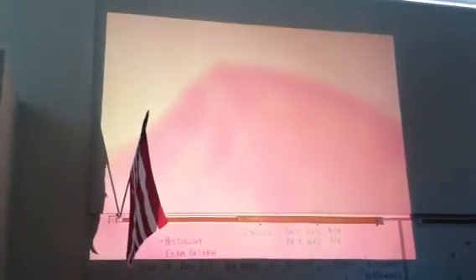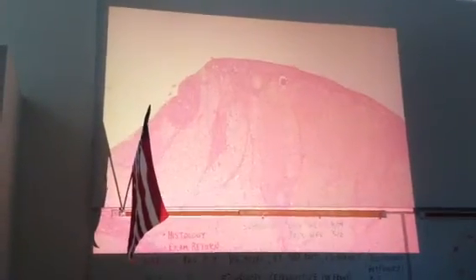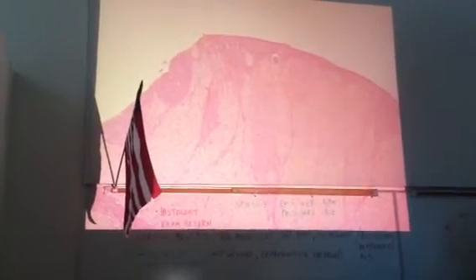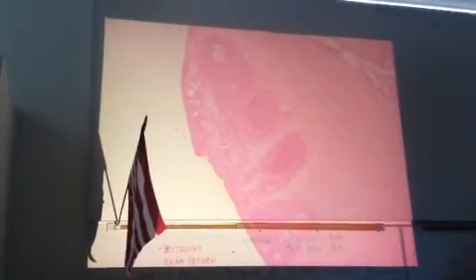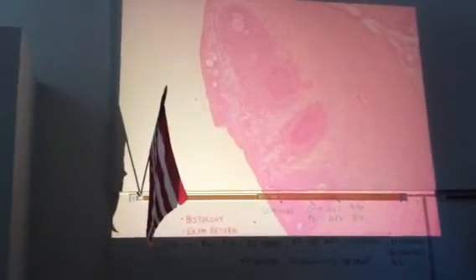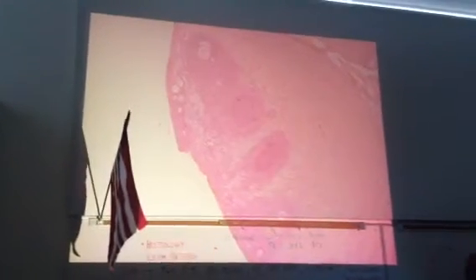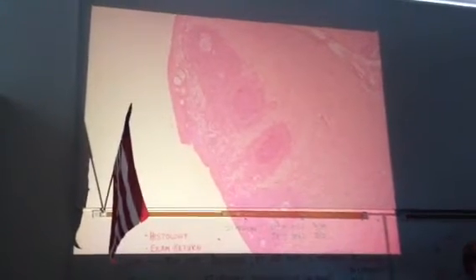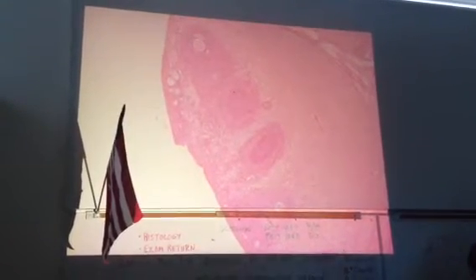And we've got 4 things to look at there. We'll talk about these today in lecture. This actually comes from a rabbit ovary, so you'll see many more follicles developing than occur in a female ovary during a cycle. We want to see a primordial follicle, a primary follicle, and a secondary follicle. The primordial is, in human females, the one that she was born with. It started into the first meiotic division when she was born, and then it's arrested until after she's become sexually mature, and we're going to mature some of those cells.